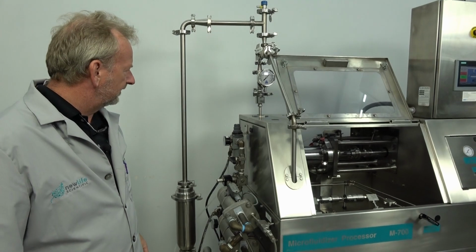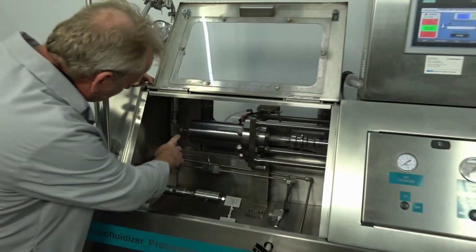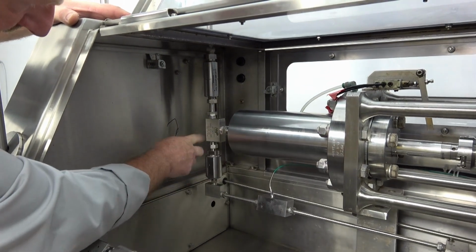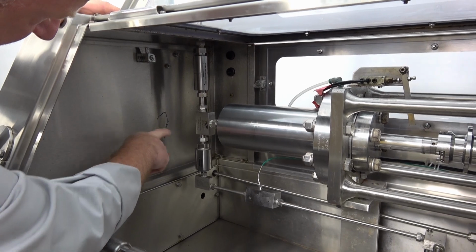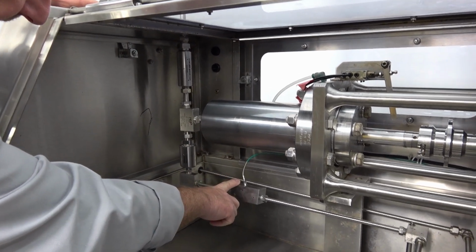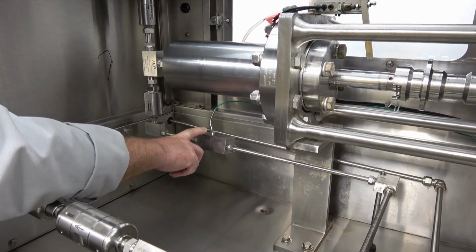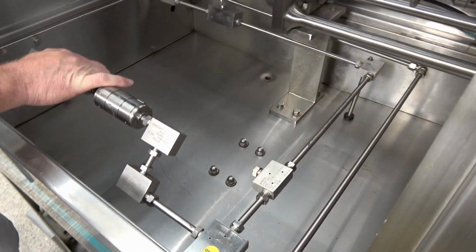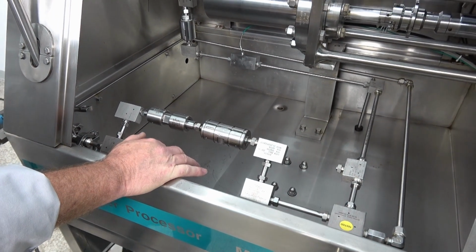And then down inside again, it pulls the fluids down and then into the pump and then pressurizes them, and that utilizes two check valves here so that we don't have any backfeed. And then here's our transducer for measuring our pressures, which you'll see on the touchscreen, and it's just pressurizing and running through over here to the interaction chambers. Now this normally is set up for dual interaction chambers with multi-channel.